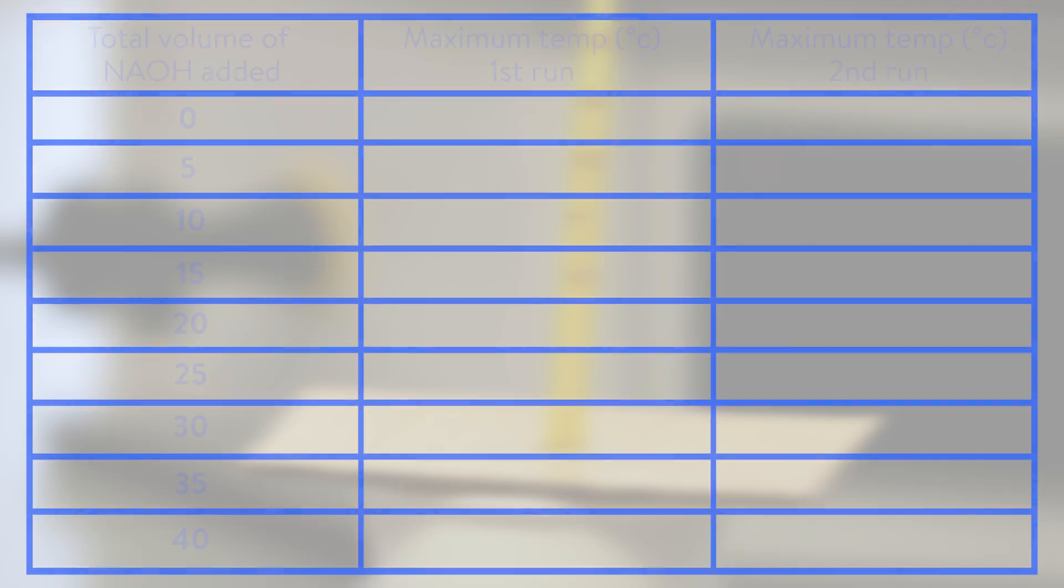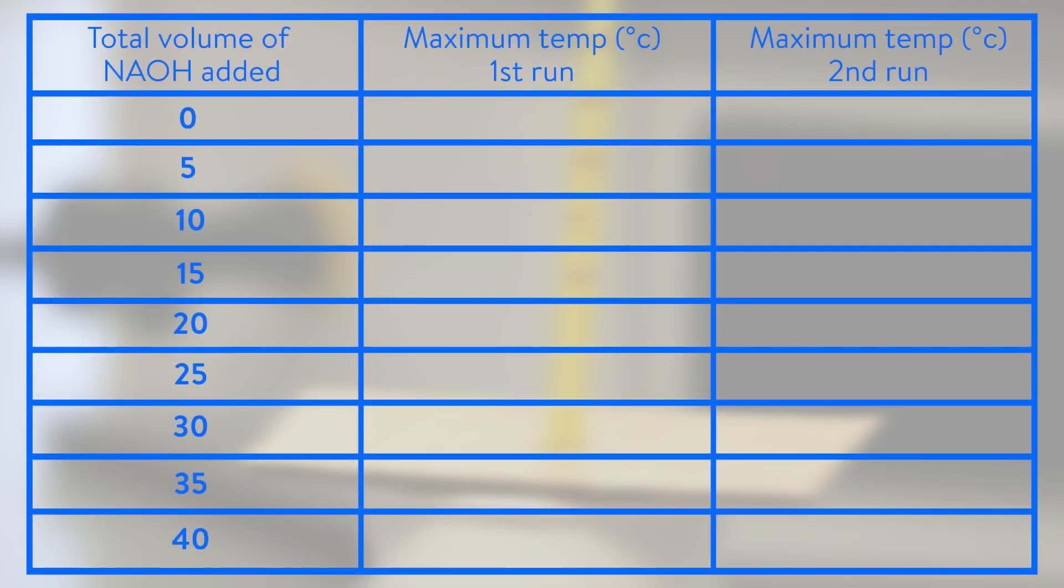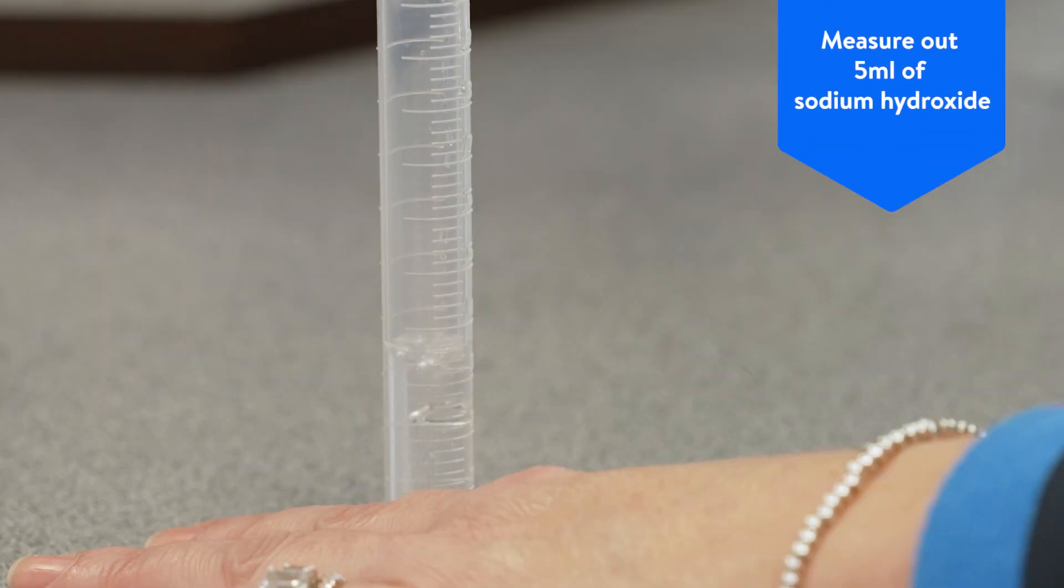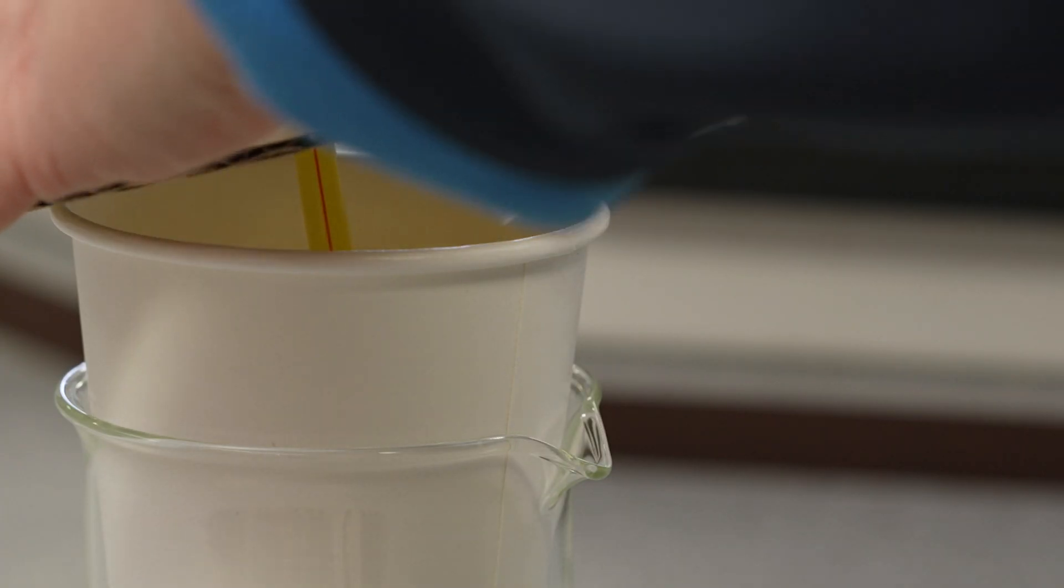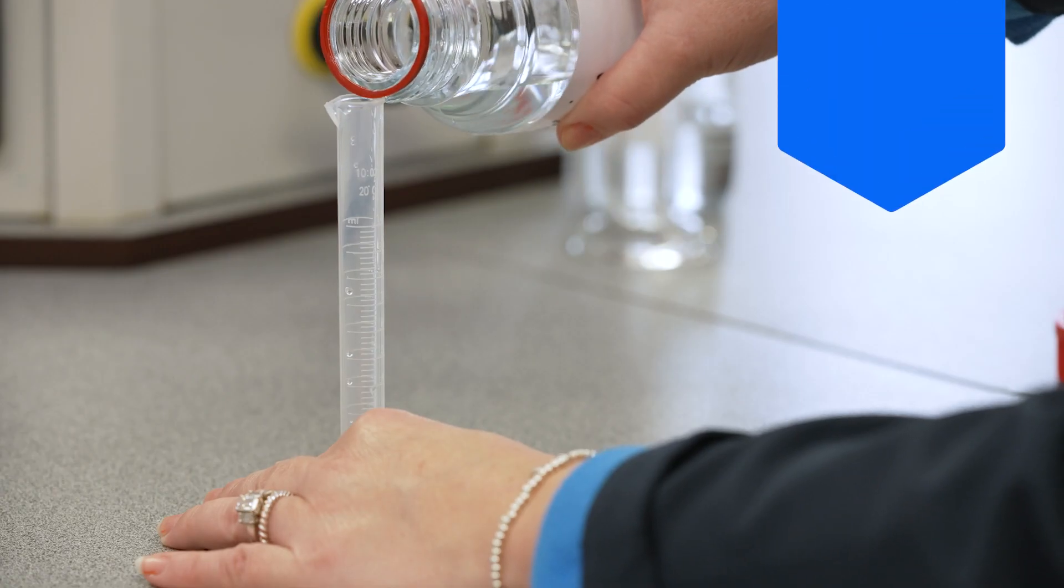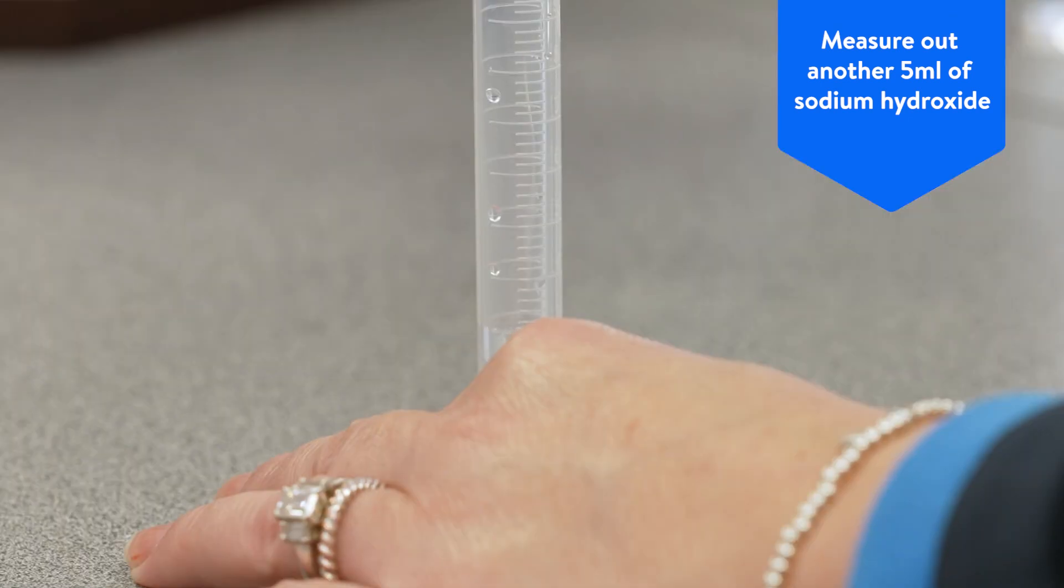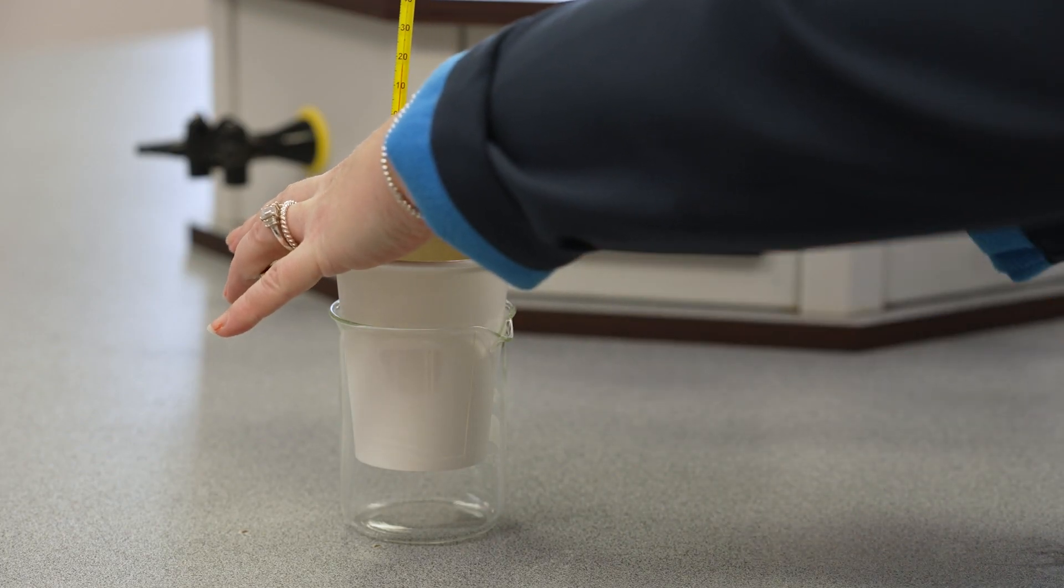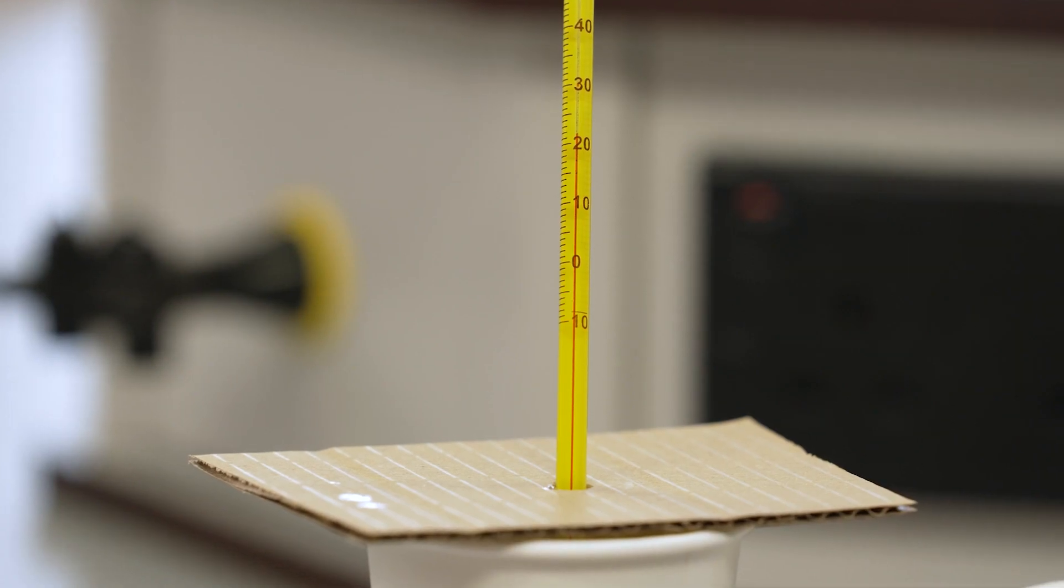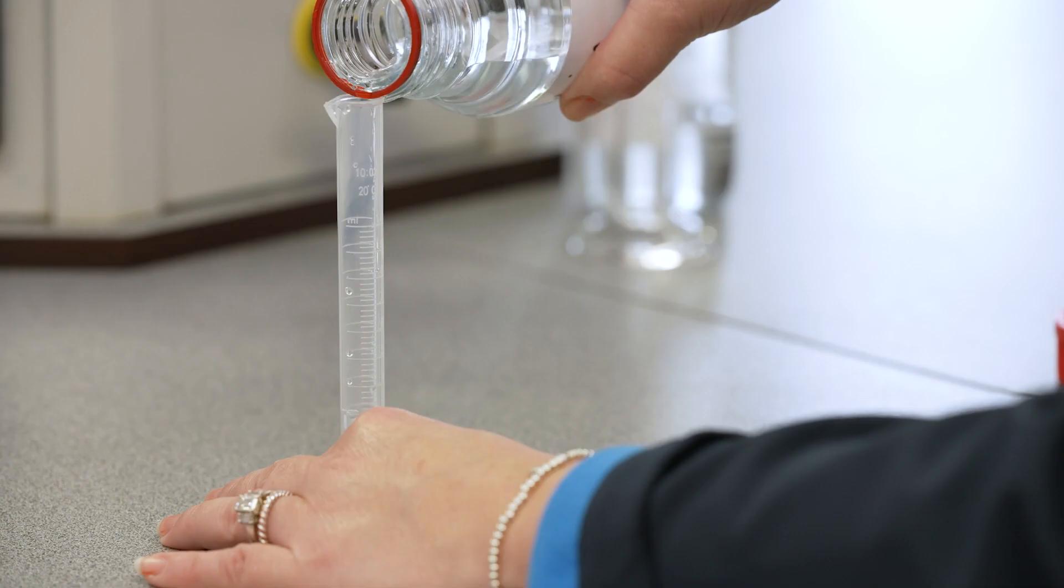Carefully measure five milliliters of sodium hydroxide into the measuring cylinder, pour this into the cup and replace the lid and stir with the thermometer. Watch the thermometer and watch how the temperature changes until the temperature has stabilized.